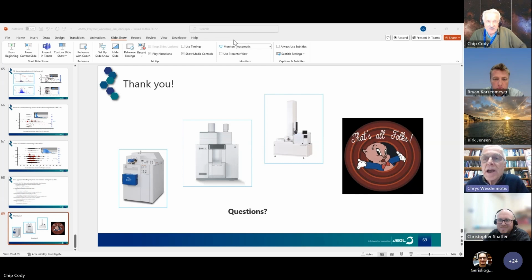Thank you. Yeah, you got my question. Very nice work, Chip. When you do GC, the columns are different, I suppose. I mean, or do you use the same stationary phase in both columns?